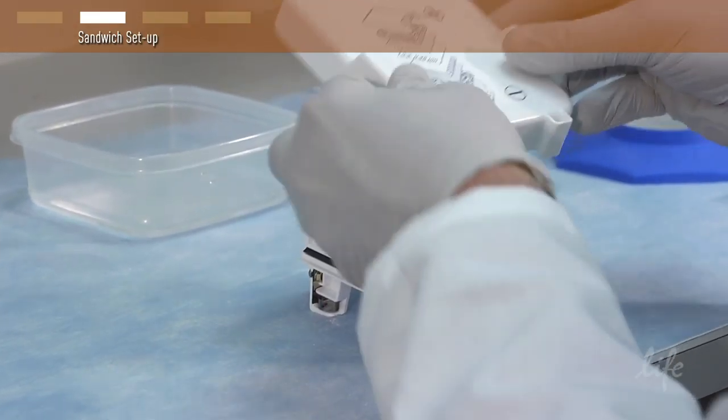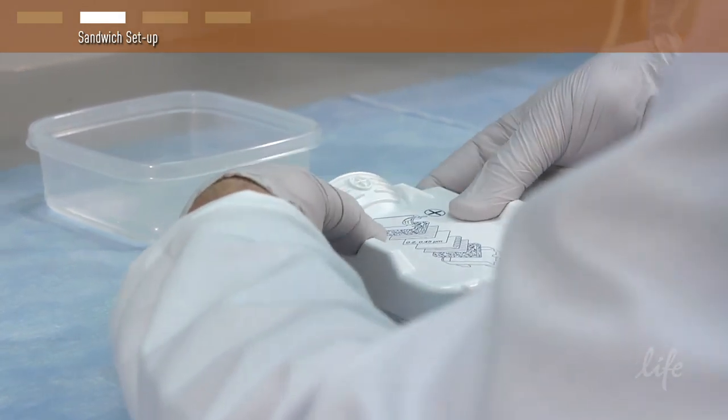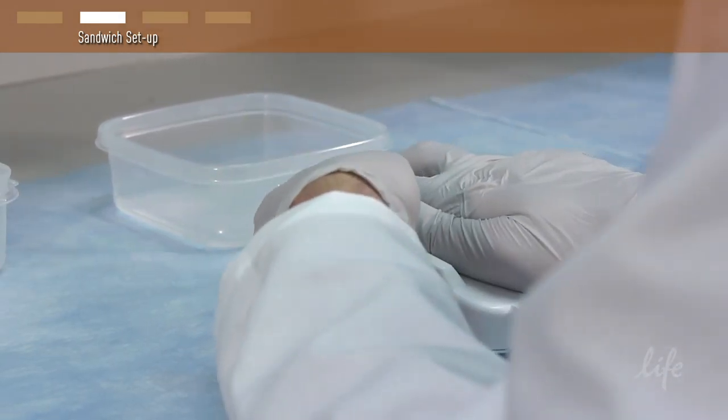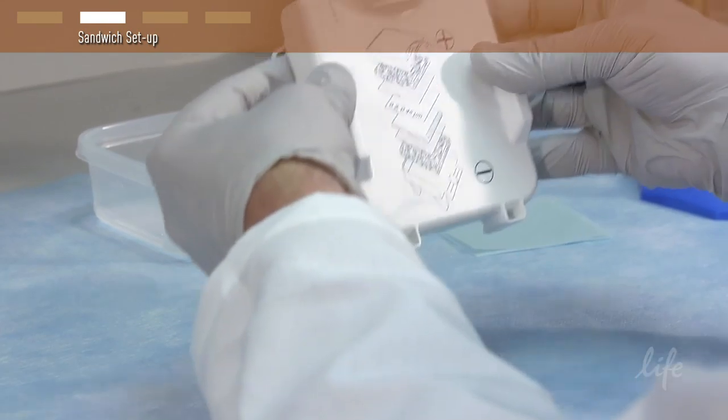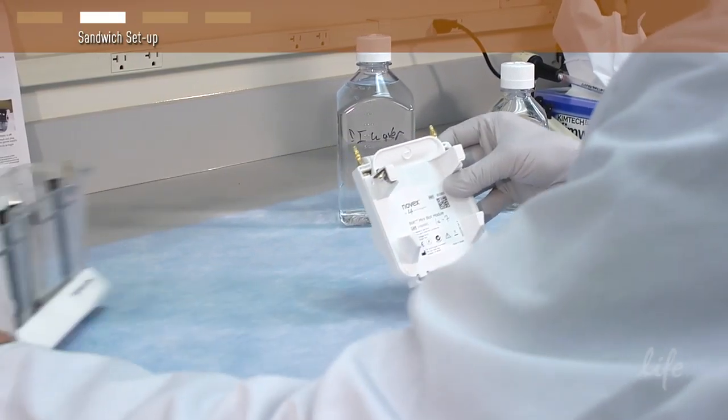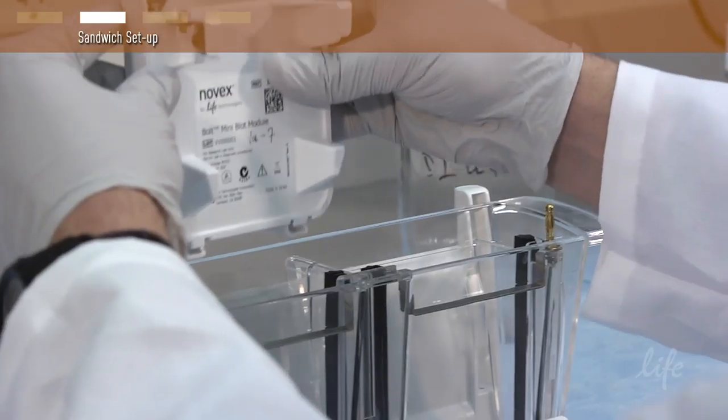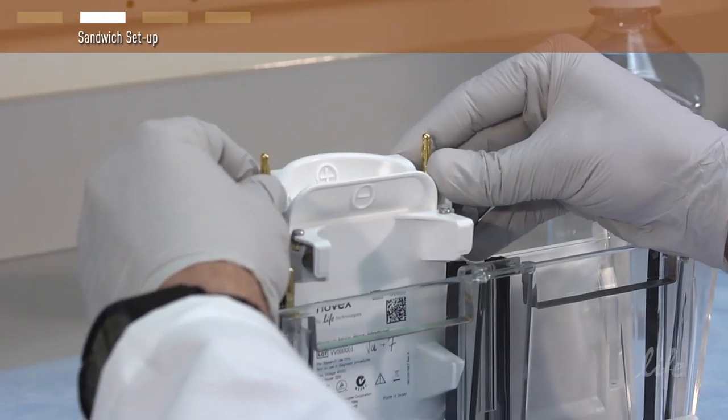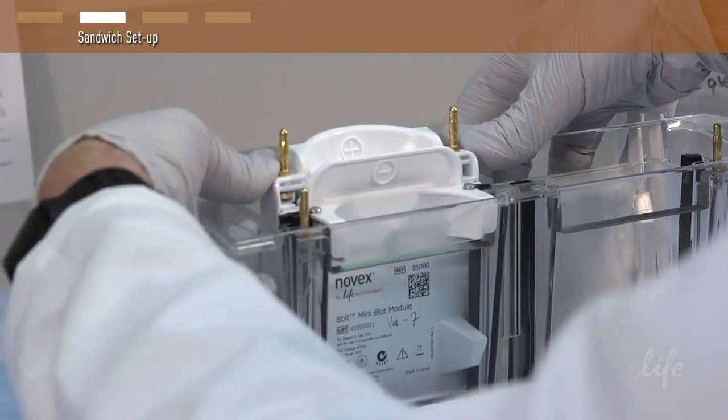Complete assembly by placing the anode or positive core on top of the sandwich and press the two module halves together. Insert the blot module into the Bolt tank with the cathode core facing the front of the tank. The blot module should be seated with the electrodes contacting the electrode bar.